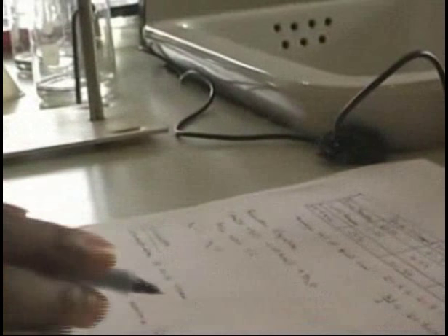Now, for the calculation, the concentration of acid used. We are going to use this formula. To find the concentration of acid used, we're going to say the concentration of base times the volume of base times the number of moles of acid, divided by the volume of acid times the number of moles of base.